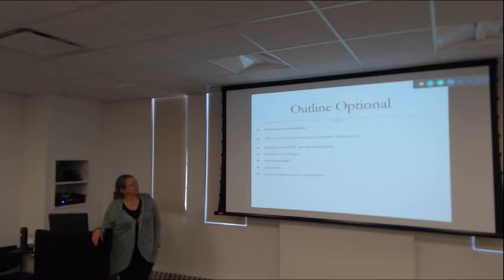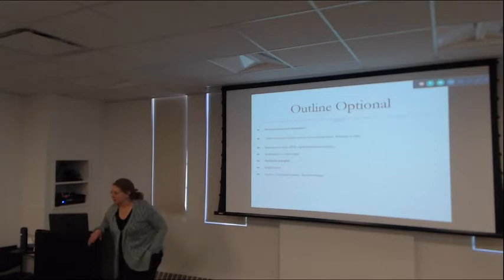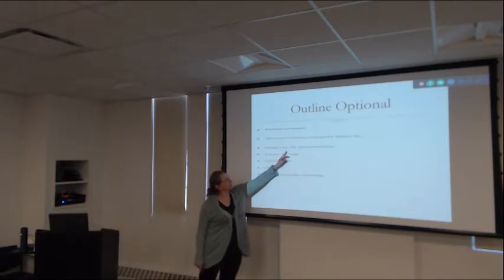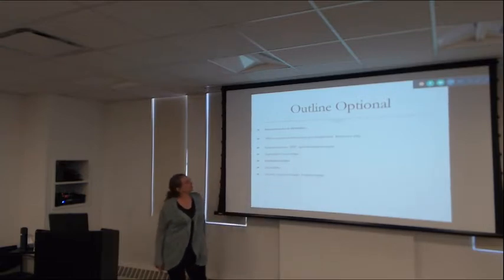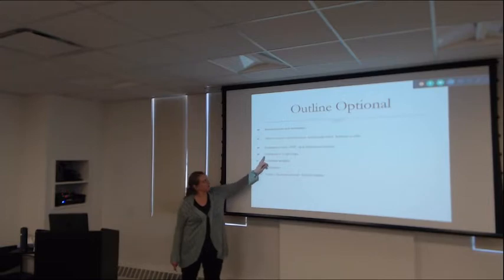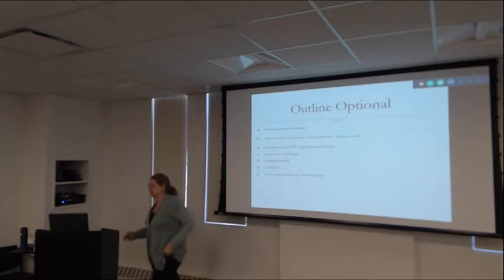I usually like to cover effects of motion, fast limit motion, slow exchange, relaxation. And if I do that, it's probably going to be after some more lectures by Art, so probably later in the term. Something we never covered here, but I like to cover if there are people here who are particularly interested, is paramagnetic systems. What does solid state NMR look like? Dynamic nuclear polarization, signal enhancement techniques. We could have a lecture or two on that if we want to do that. In the past, sometimes I covered deuterium direct detect spectroscopy.